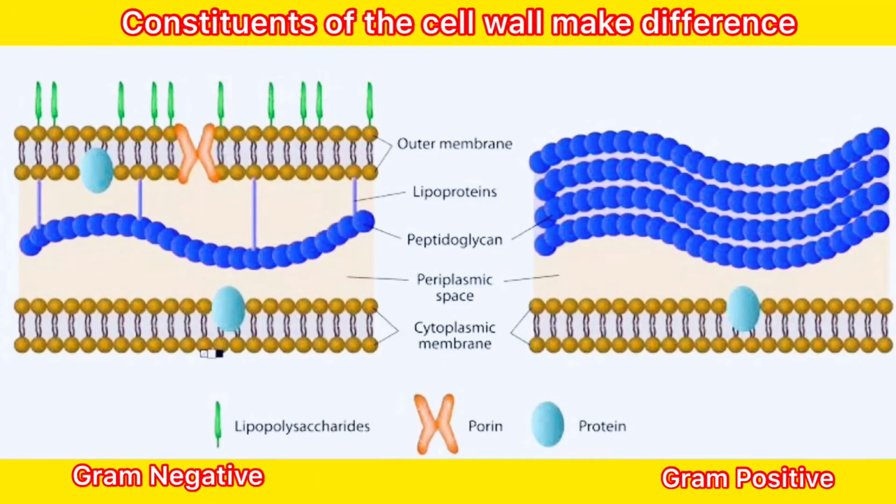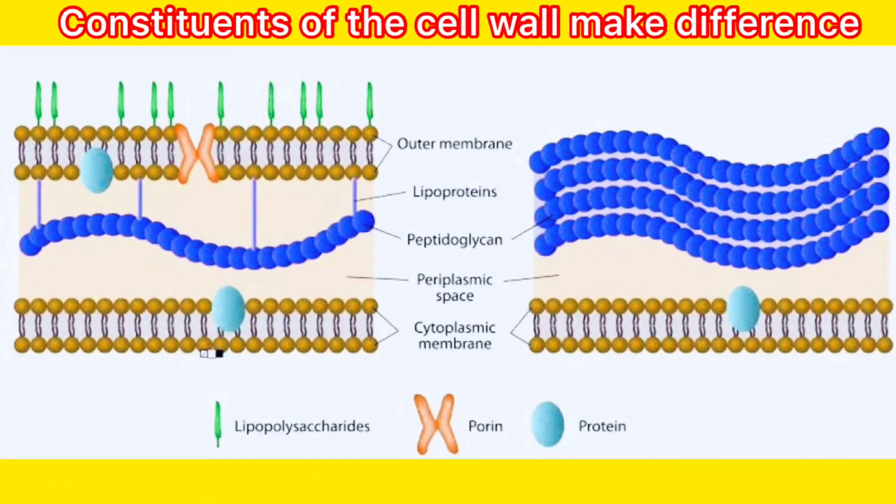We are going to differentiate bacteria on the basis of their staining method and cell wall structures.